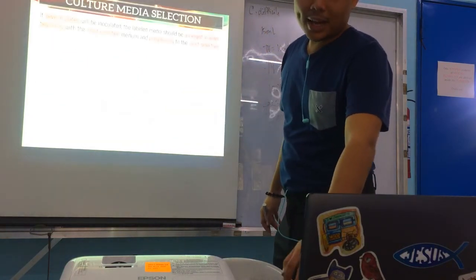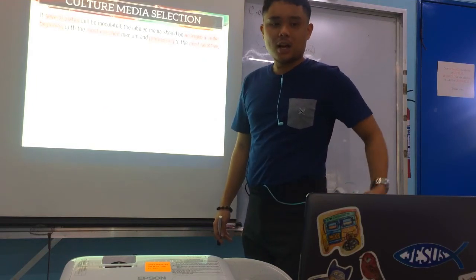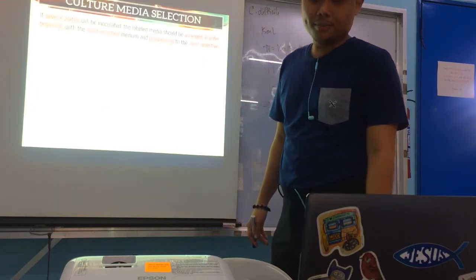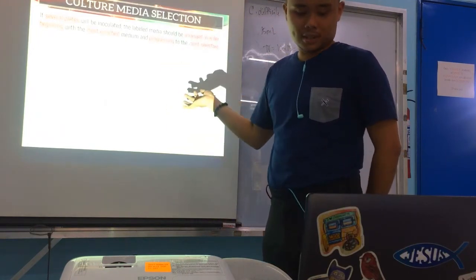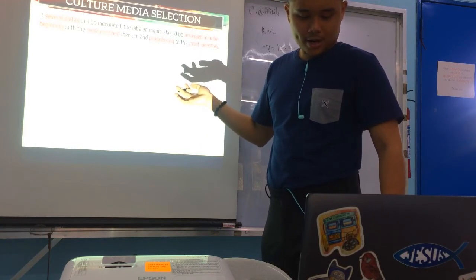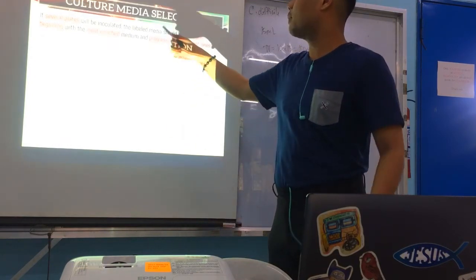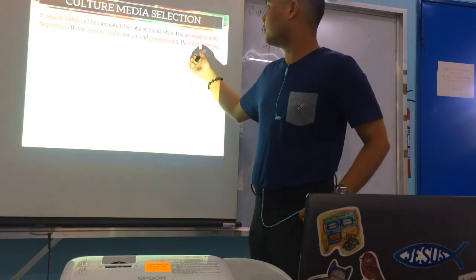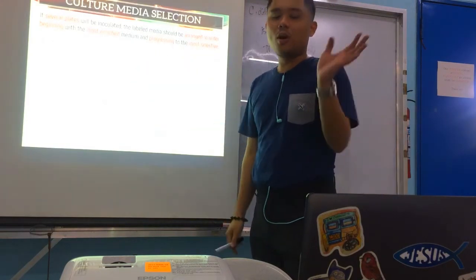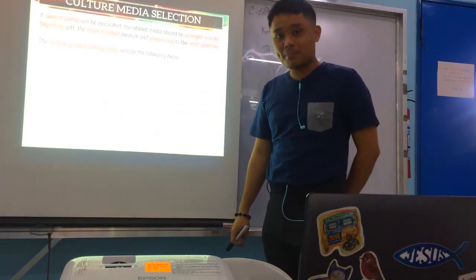Alright. Next part, if several plates will be inoculated, the labeled media should be arranged in order, beginning with the most enriched to the most selective. Because you have to remember that the most enriched can support a lot of organisms, and the most selective is more specific. So please take note of this arrangement. And we also have what we call routine primary plating media.